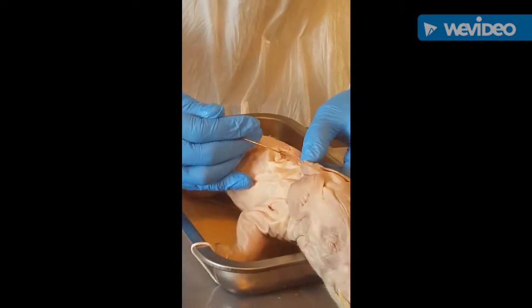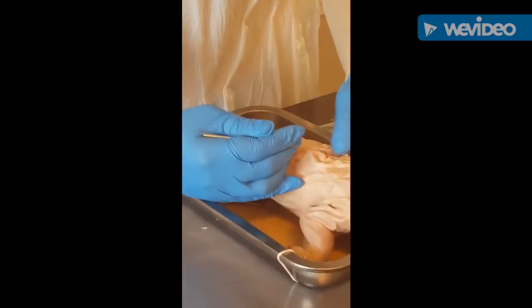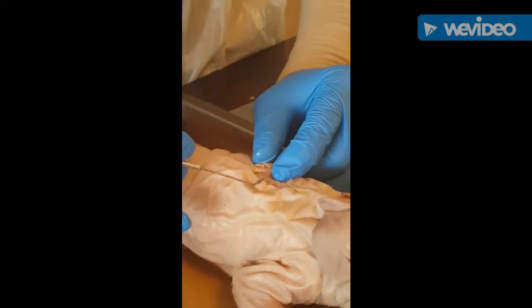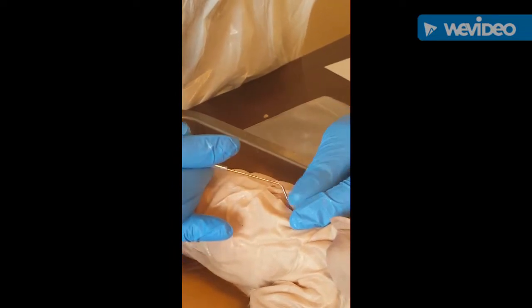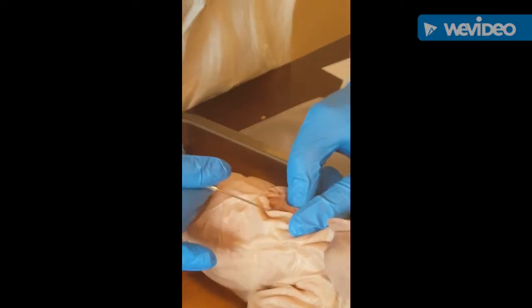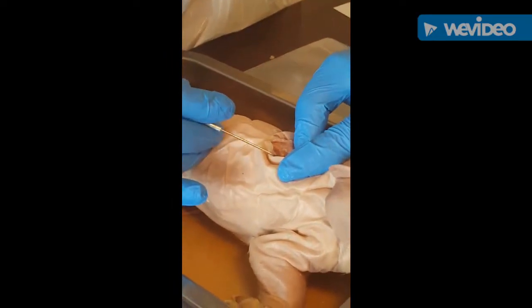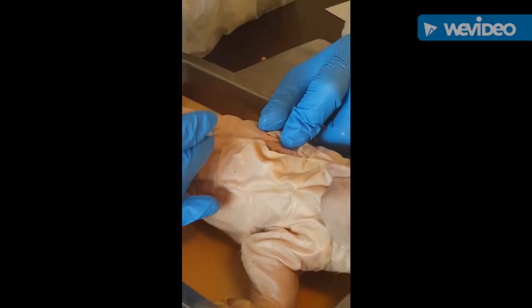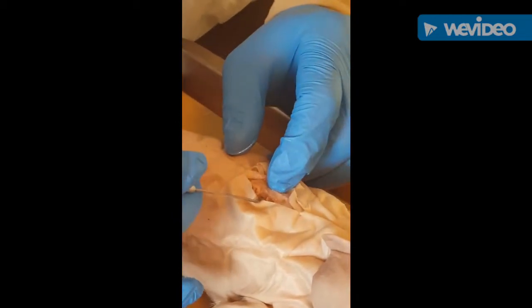One, we have a hard shell here, which is going to be that vertebral column, actually these hard, almost cartilage-like coverings. Right underneath there, we've got a couple of layers of meninges. I don't know if I can get in there without tearing this pig up too much, but there's 3 layers. There's a dura mater, which is kind of that durable hard shell outer piece.